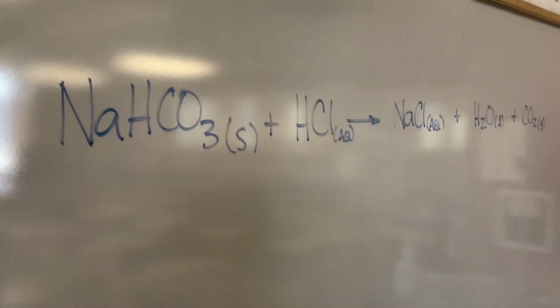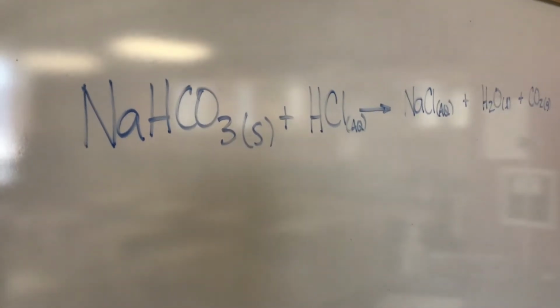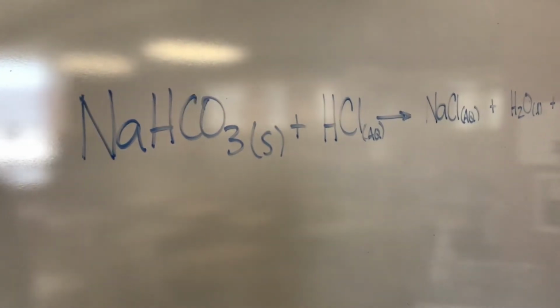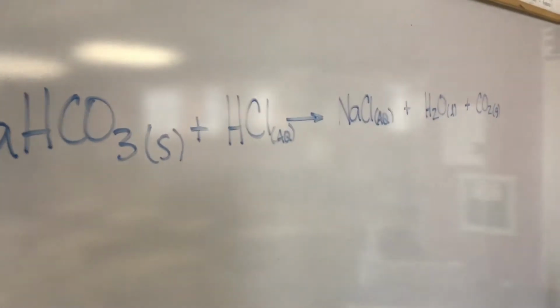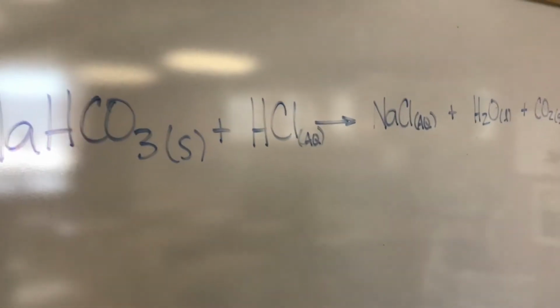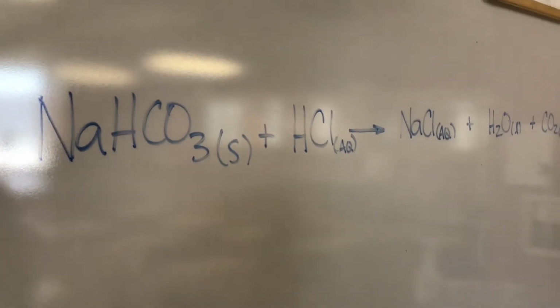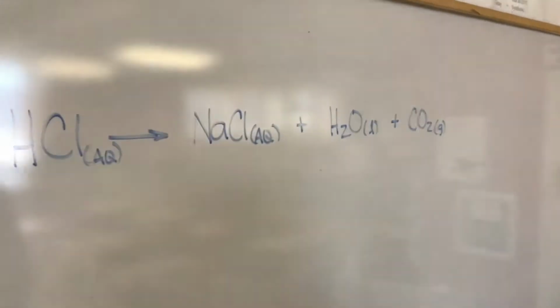NaHCO3. Have I heard of that before? Probably. It's probably sitting around your house. Better known as baking soda. Put some hydrochloric acid in a baking soda. It's the old classic chemical reaction. You ever do the volcano reaction when you were in elementary school? Bubbles like crazy. Gee, I wonder why. Why does it bubble? What does this reaction make?